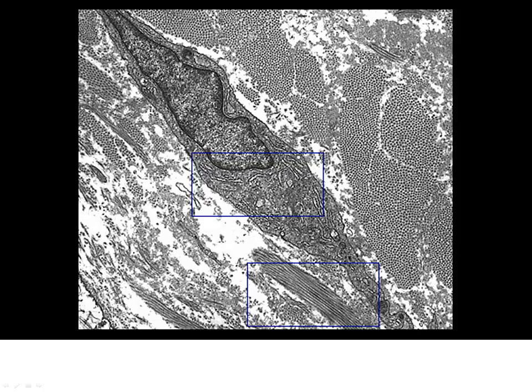What about these structures, these parallel railroad track structures? The rough endoplasmic reticulum, you can sort of see the rough area there. What about this right here? This is cutting cross section, so it might be a little bit more challenging to see that. That's a mitochondria, and we have some little vesicles that we see budding in there, possibly there, another one there.